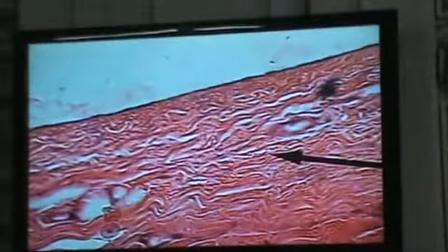And then now, you see a beautiful layer right here. Okay, and that is the tunica what? Vaginalis. Okay, so that's the tunica vaginalis. So there you can see right here. Yes, very good. That's the tunica. Let's look at it at a higher power. Okay. So that there, that's the tunica vaginalis. And there we see now how thick the what. So you see this is very, very thick. Okay, quite thick. And that is the tunica albuginea.